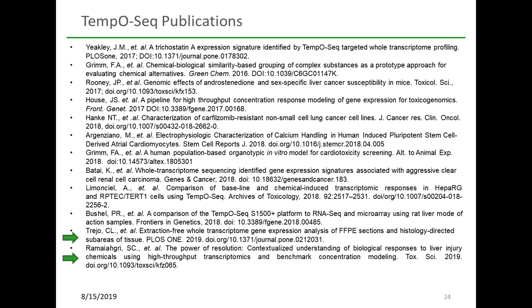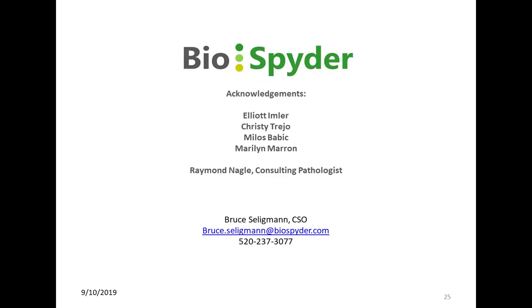In particular as well, the use to provide dose response data and complex analysis across the whole transcriptome or across a set of 2,000 or more genes has also just recently been published, and I think does represent a whole new avenue of investigation and opportunity, both within bulk samples and in vitro studies, and then at the spatial resolution level as well.